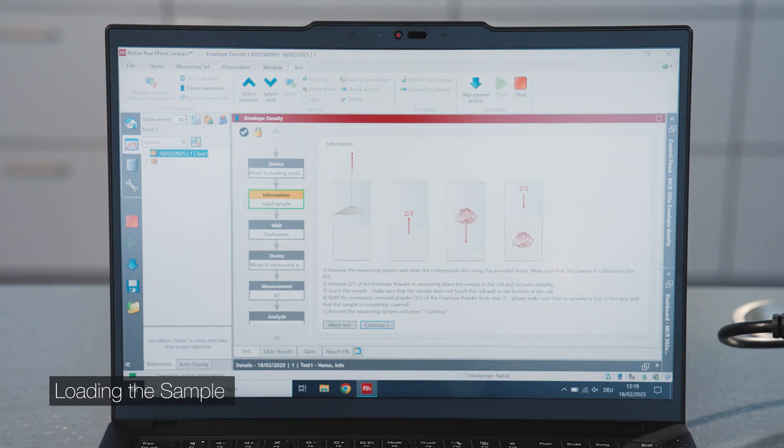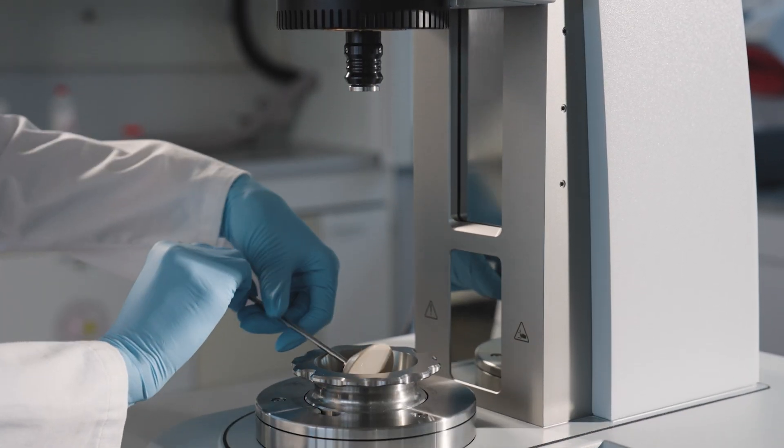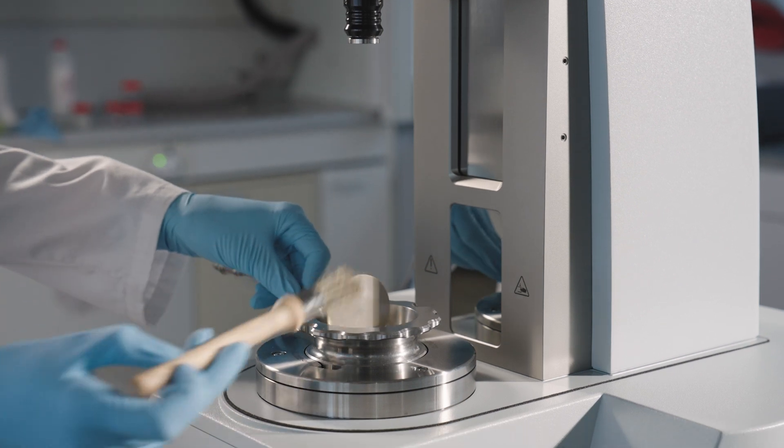After completing the reference measurement, insert the sample according to the instructions in the software. Remove the measuring system. Ensure that no powder is lost.